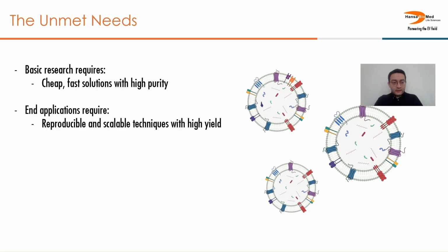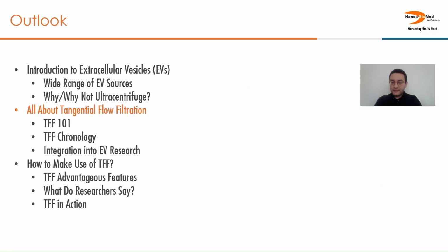So in short, in two different aspects of the EV field, basic research requires cheap and fast solutions with high purity, whereas end applications require reproducible and scalable techniques that can provide high yield. And this is where we will start introducing tangential flow filtration.